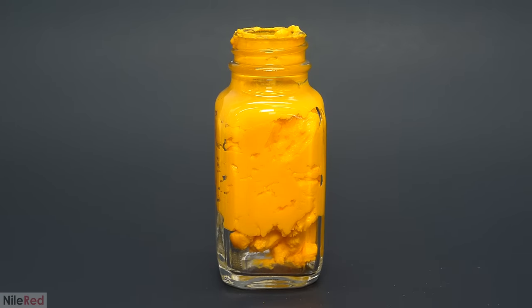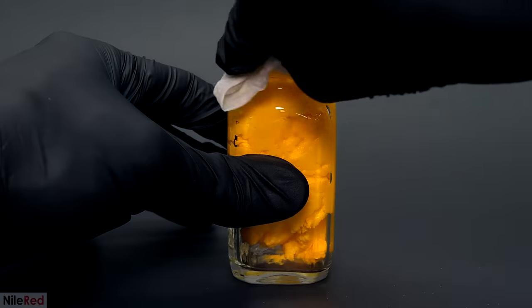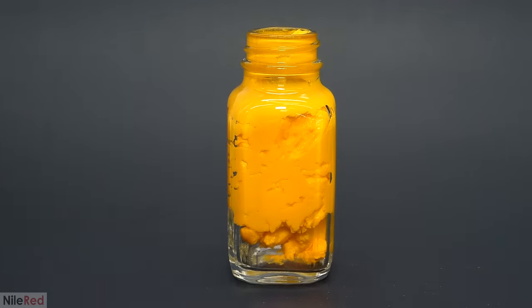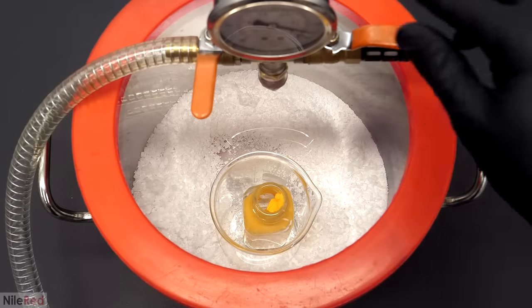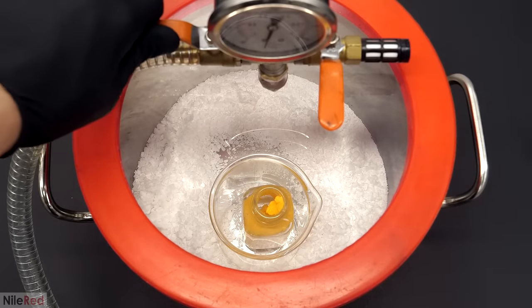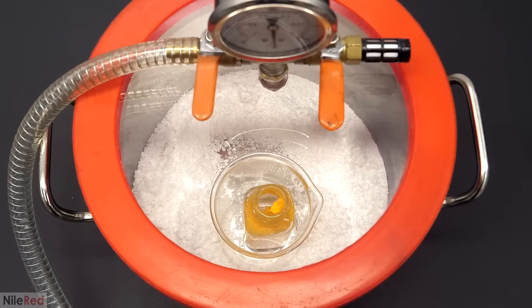There was a bit of uranium that managed to get on the outside of the bottle, and I cleaned that up by just wiping it down a few times with some wet paper towel. Now, with all the uranium safely in the bottle and none of it on the outside to poison me when I touched it, I was ready to finish drying it. To do this, I put it into the same vacuum chamber and pulled a really strong vacuum on it. I wanted it to be as absolutely dry as possible, so I left it in there for three or four days.